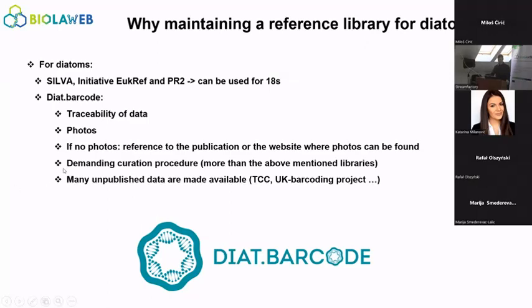And there is also a demanding curation procedure, which is much stricter than for the libraries I mentioned above. Also, there are many unpublished data which are made available in Diatom.